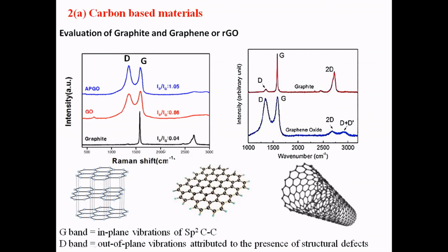But if you peel off or take out some layers, like graphene or graphene oxide by synthesis, you end up with a lot of defects because you are ultimately scratching a few surfaces. That defect intensity you can see here, there is a very small intensity, but the D stands for defects. So you can see the defect band, and you can tell it is not pure graphene. It may be a graphene or graphite oxide.